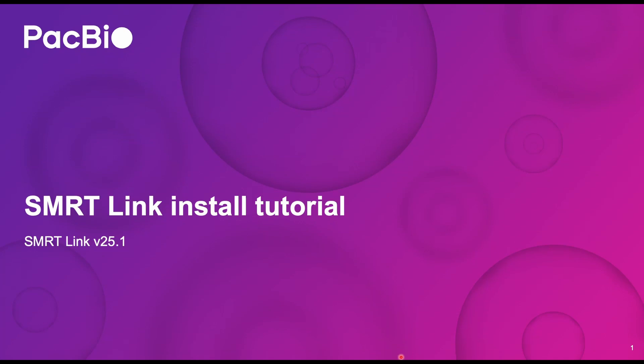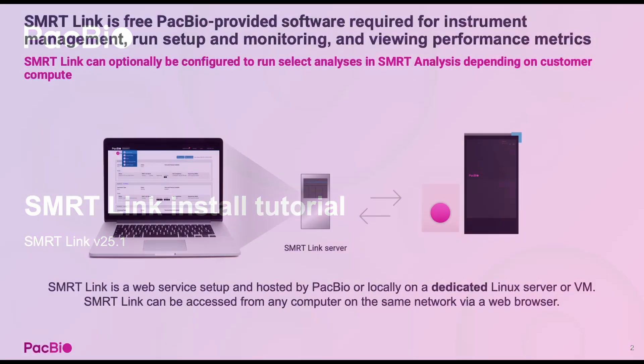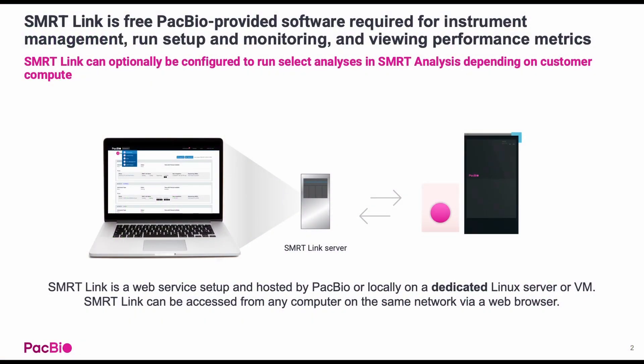Hello, welcome to the SmartLink installation tutorial. SmartLink is a free PacBio provided software required for instrument management, run setup, monitoring, and viewing performance metrics.